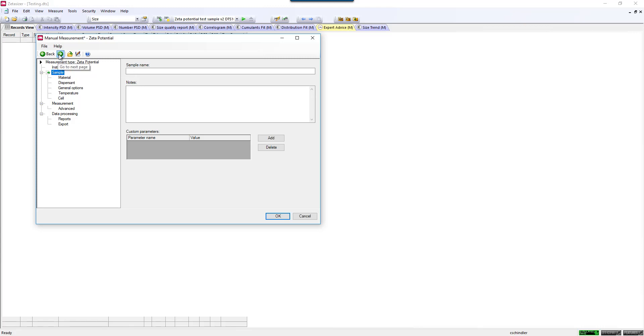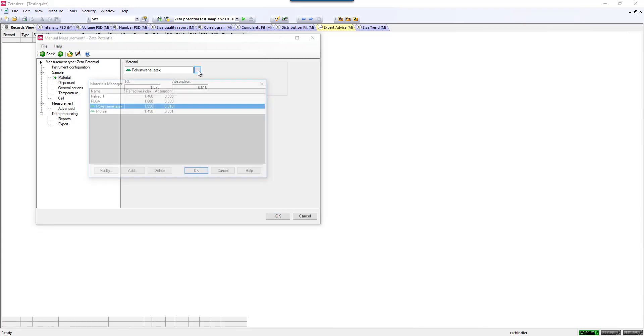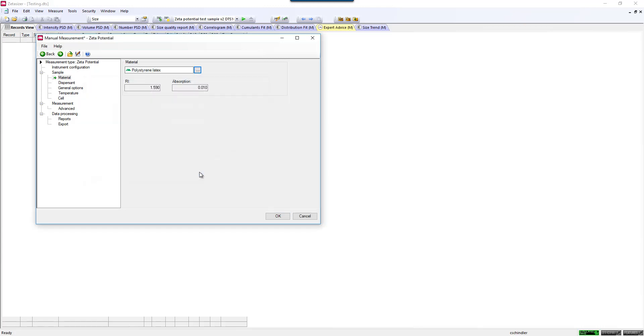You can tab through the different parameters and enter in the information, such as the Materials Refractive Index. This one is not critical for the Zeta Potential measurement, but is more for record keeping. There is a small library of different Materials Refractive Index, or you can add your own. Since it's not a critical component, you can just leave it as a default amount as well.